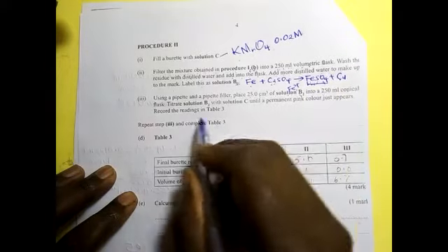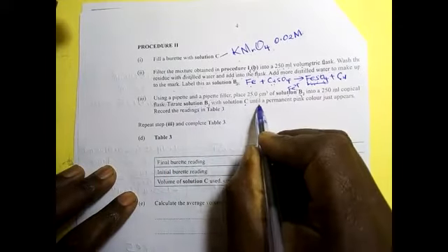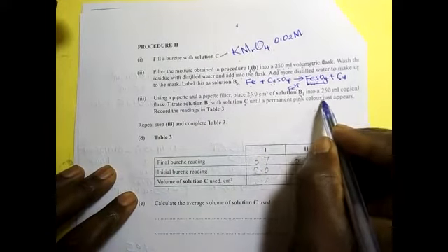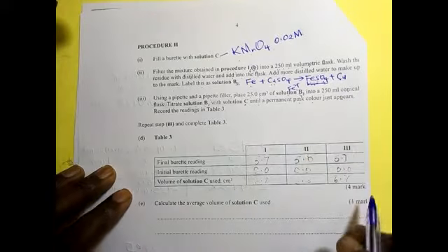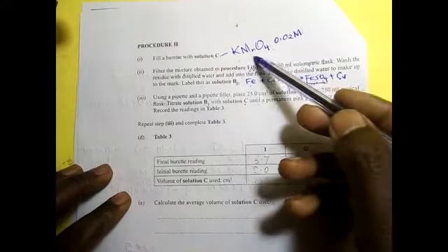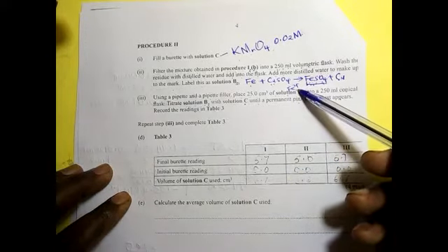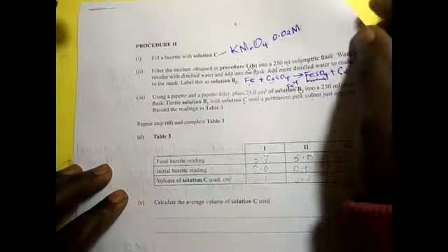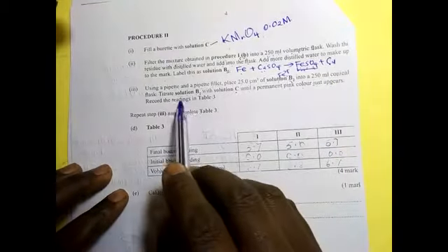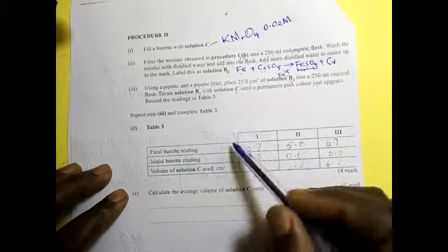That is what you need to understand. Into the conical flask, titrate solution B with solution C until a permanent pink color just appears. Very correct. Remember, this one is an oxidizing agent, so it is going to oxidize iron 2, and then we are going to see. So when the permanent pink color just appears, then we record in our table.